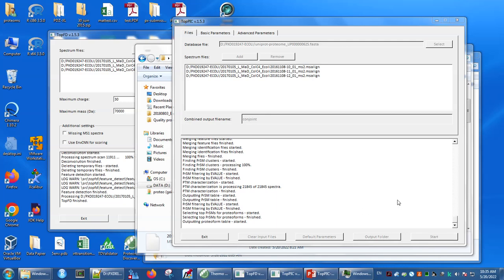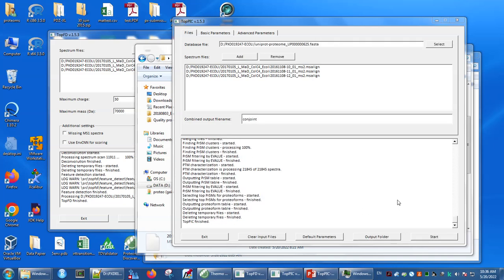Certainly, if you want to evaluate PTM placement more aggressively, you would not just look for one mass gap, but two per PrSM. But that would make the search run longer, and I didn't want to do that for this particular search. Certainly, if you have a very large number of modifications on individual proteoforms, more than two, which is not that uncommon an outcome in modified proteins, you should probably look at using TopMG, which is another tool that also ships with the TopPIC suite. TopMG is a whole lot better for allowing for up to 5 modifications on an individual proteoform. And with that, we're finished.